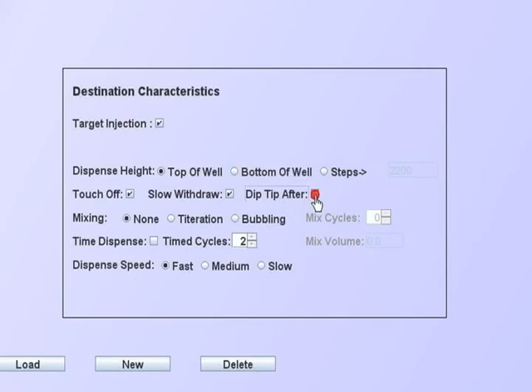The dip-after function allows the tip to go back down into the dispensed liquid to touch-off clinging drops. These are special functions that are available if a situation can benefit from their use.